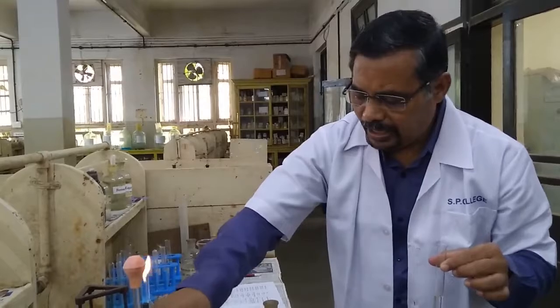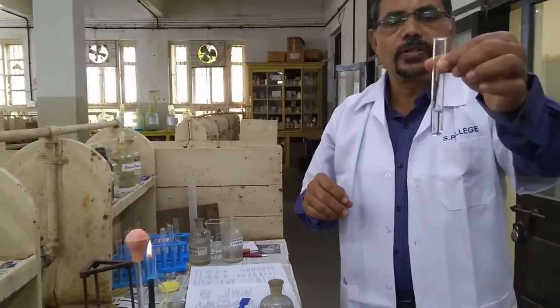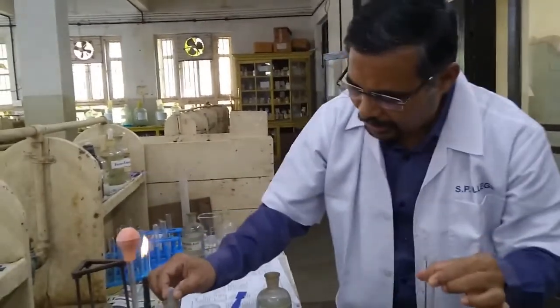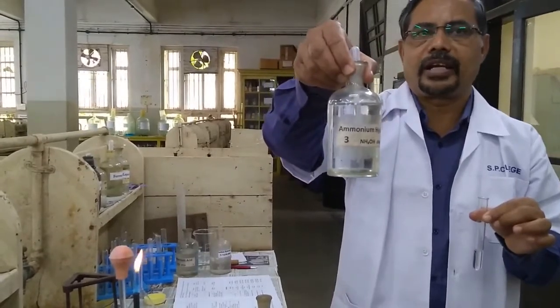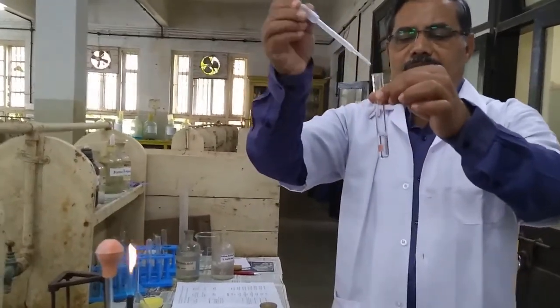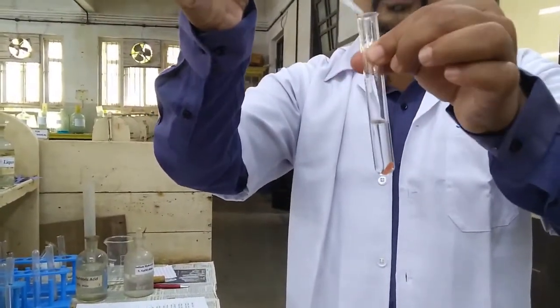Then I will add one piece of red litmus paper in the test tube. So you can easily see this red litmus paper piece in the solution. Then I will slowly add this ammonium hydroxide, that is NH4OH, till the color of the red litmus becomes blue. That solution is called an alkaline solution.